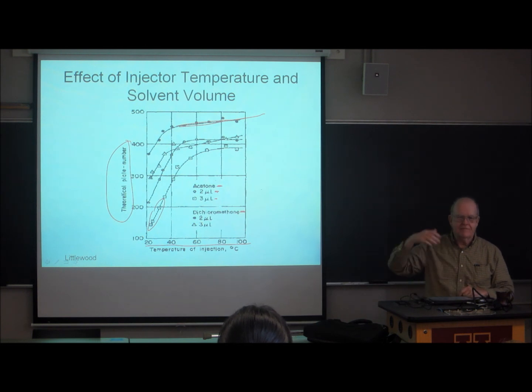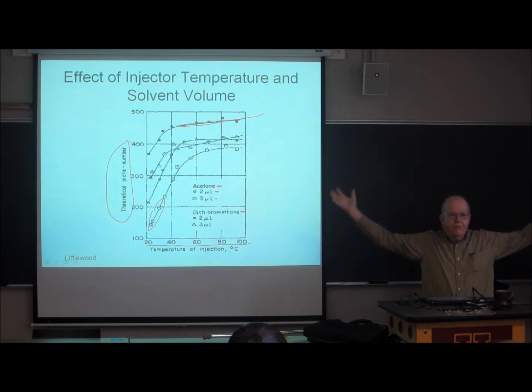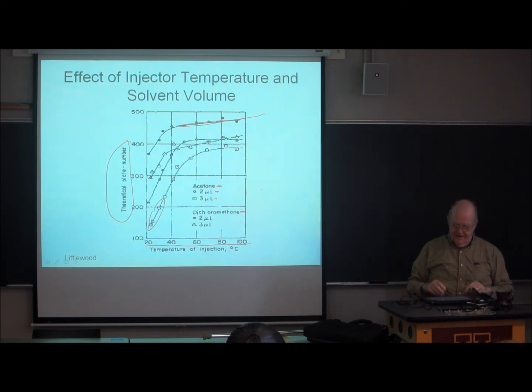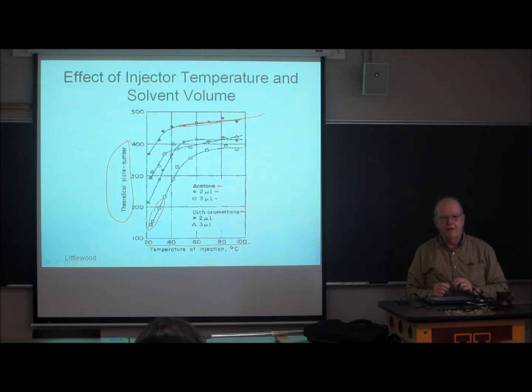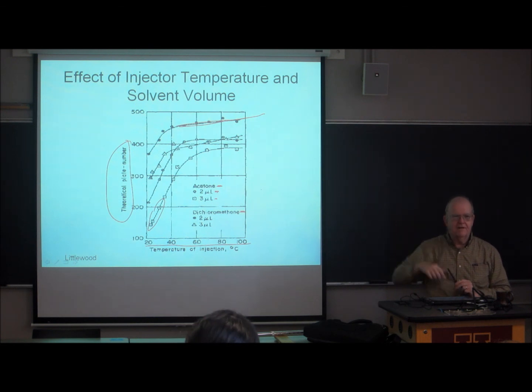So that's a factor of over 220. So this microliter, or 2 microliters of solvent goes like that. You want it to be fully contained in the liner so that it can enter the column as a plug and not as a big explosive mess.